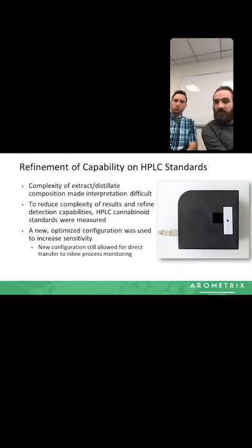Now, the reason these HPLC standards are important is that you end up having a solvent and the desired component. So basically I'm going to have my delta 8 and I'm going to have a solvent. We could already throw out the solvent to make sure that the solvent itself didn't fluoresce or absorb too much. Therefore, we could isolate the different fluorescence responses from the actual cannabinoids.